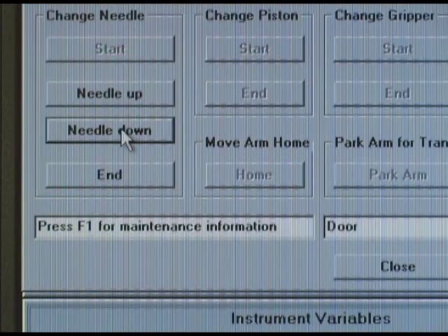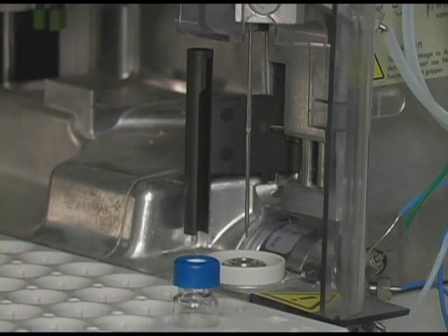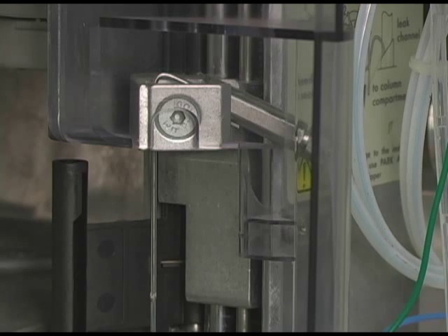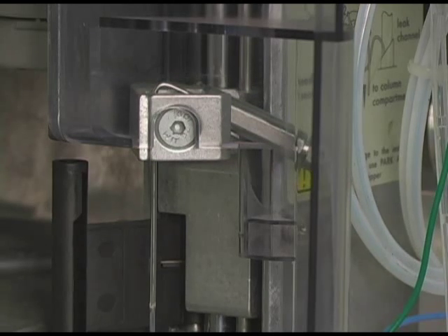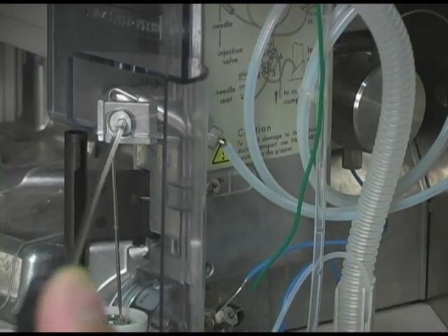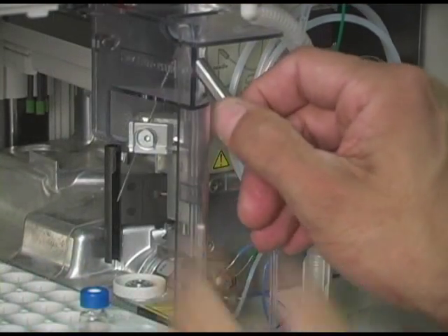With the front cover removed, click on the Needle Down button repeatedly. Continue clicking on the button until the Needle Set Screw is aligned with the hole in the Safety Cover. Once the Set Screw is accessible, loosen but do not remove the Set Screw from the Needle Arm.